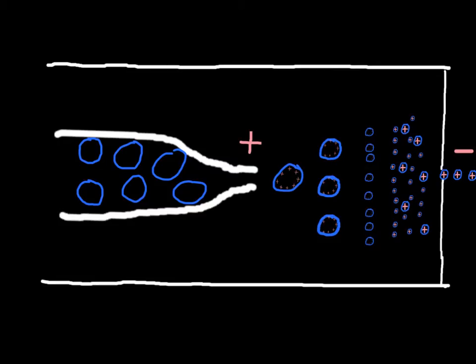I found it quite hard to find a decent diagram of time of flight mass spectrometry, so here's one I drew. We've got this thin needle, and your sample is being ejected. You can see the thin needle is positively charged, so it removes electrons. Here you can see the sample along with the solvent, positively charged. This starts to separate until we get these positive ions separated. In this case these are different isotopes: you've got the smaller isotope and the larger isotope.